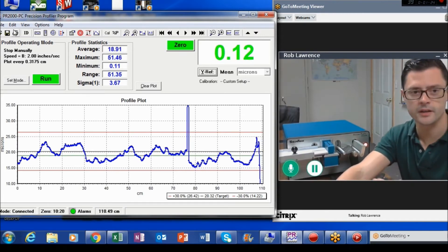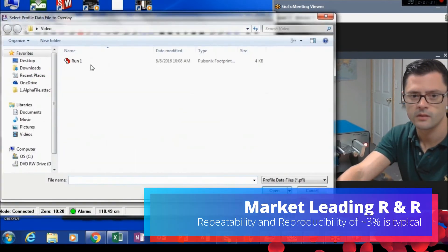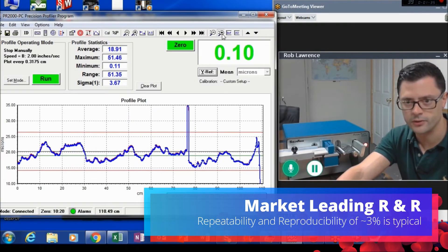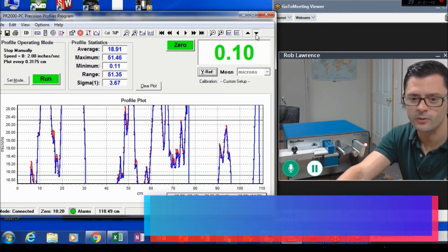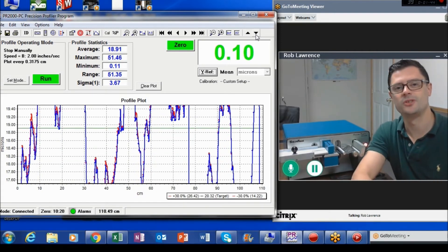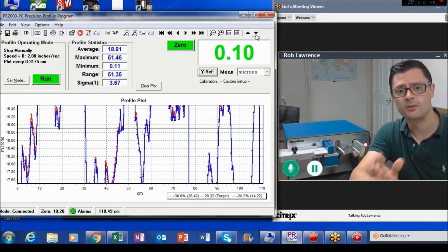Okay, so we go ahead and open up our previous run, and you can see the red versus the blue line. I'll zoom in a little bit so you can see it a little better. We're very reliably characterizing this extrusion, and this helps you see what you're doing — what you're producing, or what you're buying — better than anything else on the market.